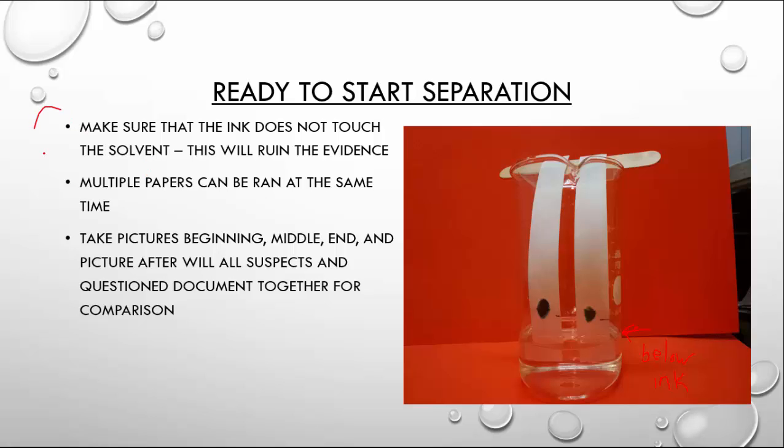Make sure that the ink does not touch the solvent — this will ruin the evidence. So make sure we get that ink above the solvent level.